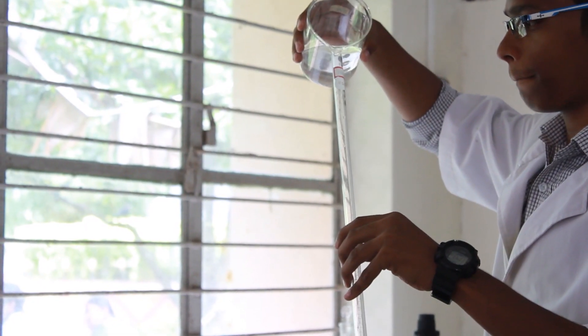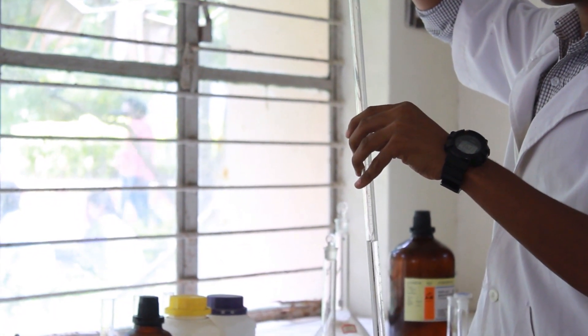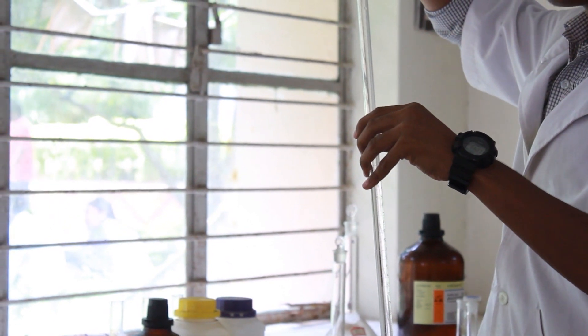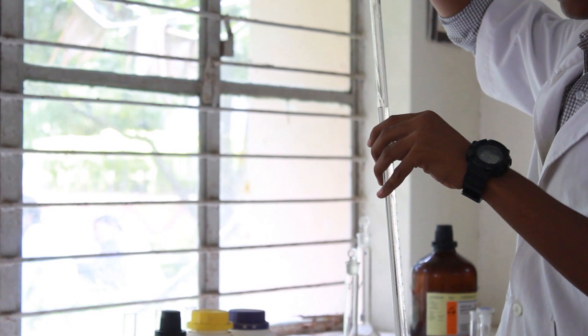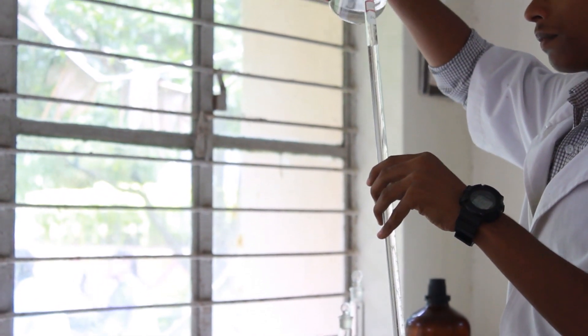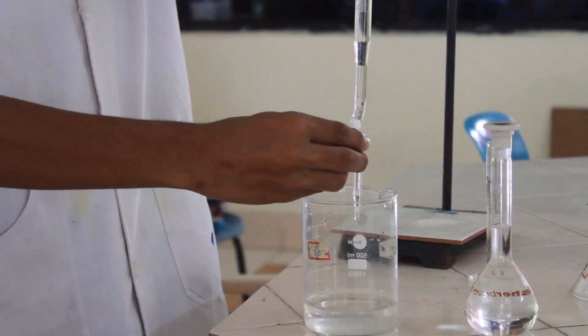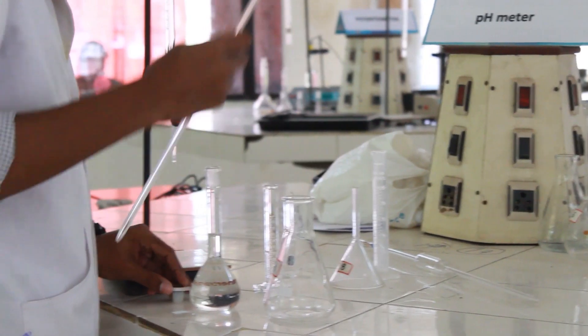Now pick up a burette which is already cleaned, fill it with sodium hydroxide solution, and verify for the absence of air bubbles or any air gaps in the burette to avoid any errors. Now adjust the level of sodium hydroxide solution to zero by slowly opening the nozzle of the burette.